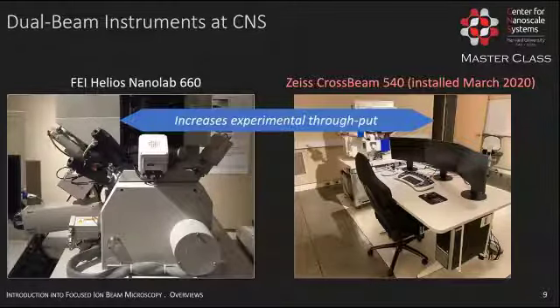It can do many tasks as the Helios, so that means we have now dramatically increased our bandwidth and hopefully improved the throughput of the data analysis for our users.